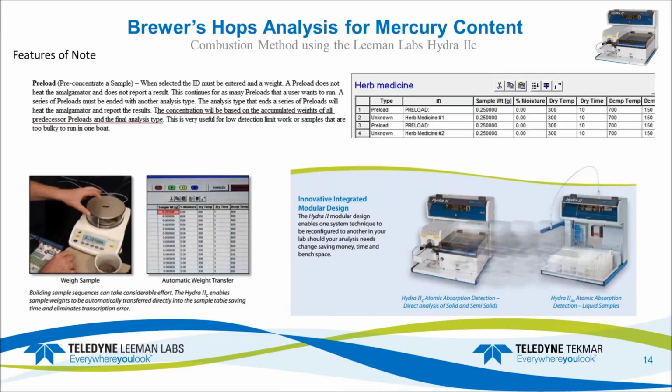A few quick notes on some of the features I used or didn't use. As I said, you can set up the instrument. You can connect it to a scale, and as you weigh them out, the system will input it into the sequence page for you to make things go a little bit faster.